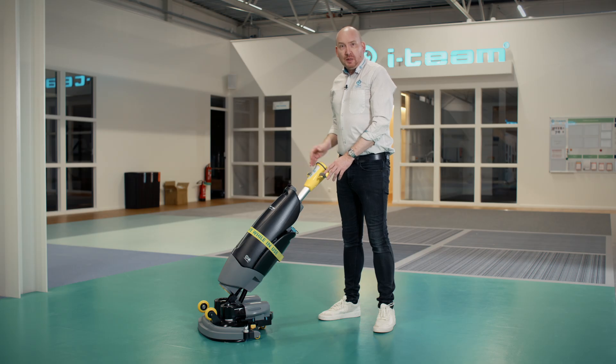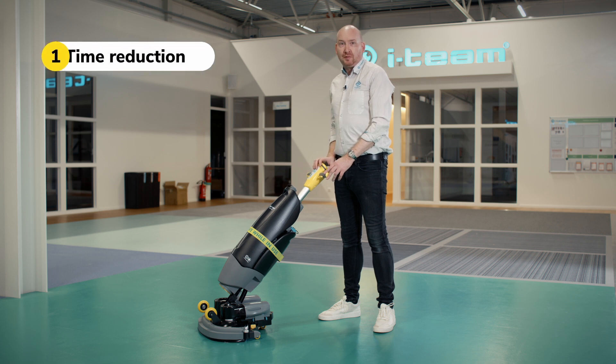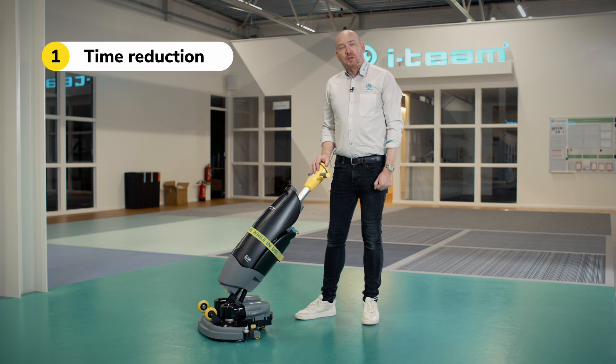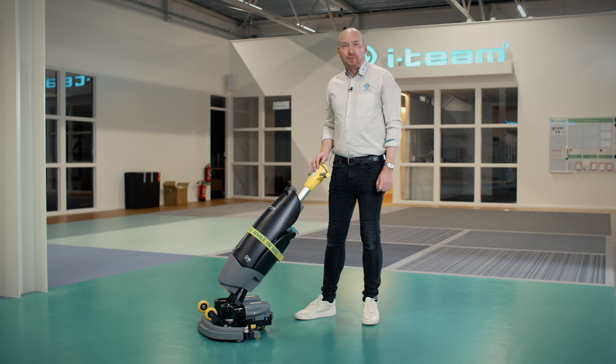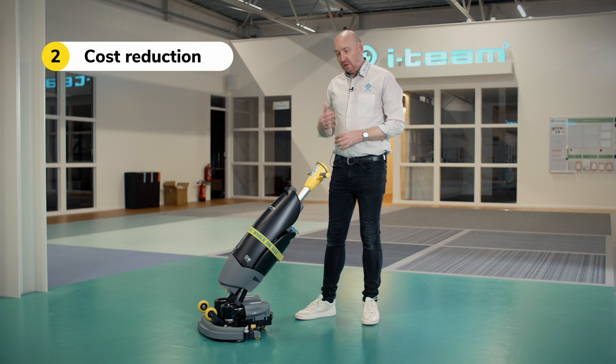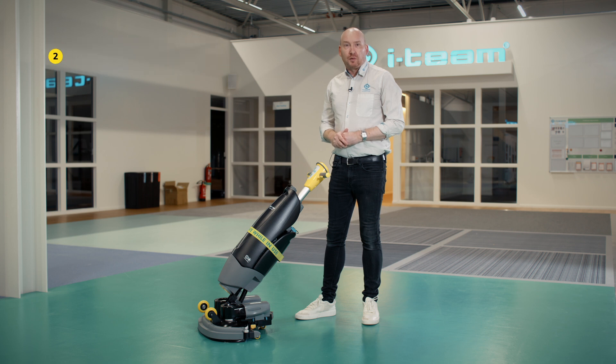So what are the key benefits of the Safety IMOP? First, we have time savings — you can clean a hundred square meters in 10 to 20 minutes, much faster than typical manual cleaning in a clean room. Then we have cost reduction. Imagine having to shut down your clean room for cleaning; because we save you time, you have less downtime for your clean room.